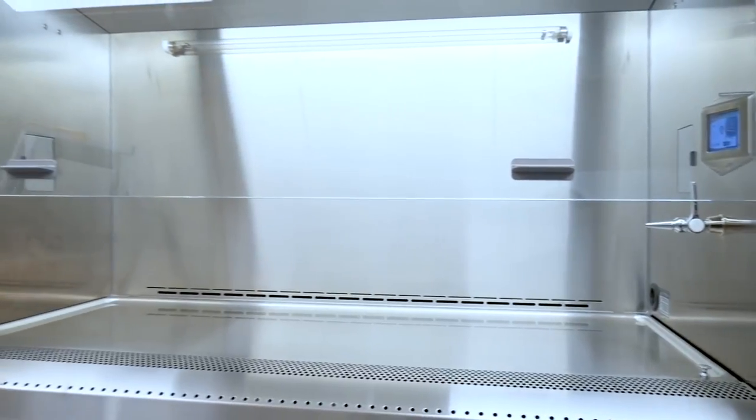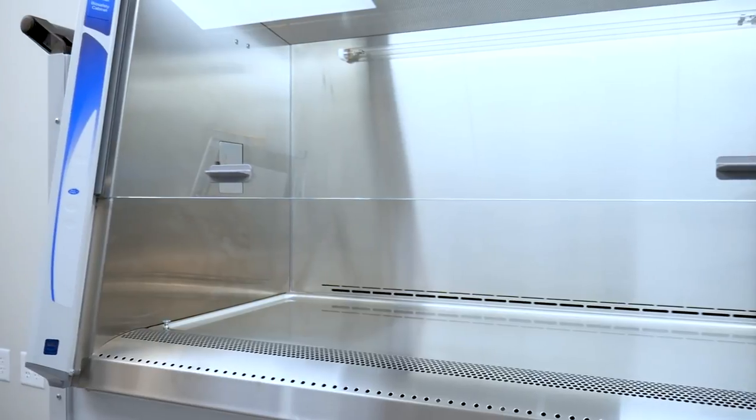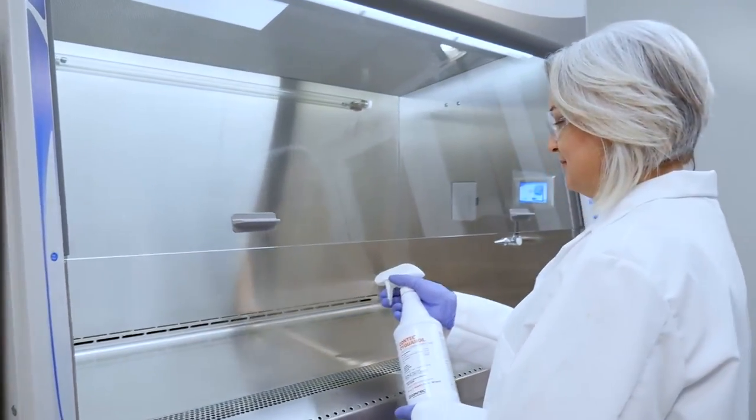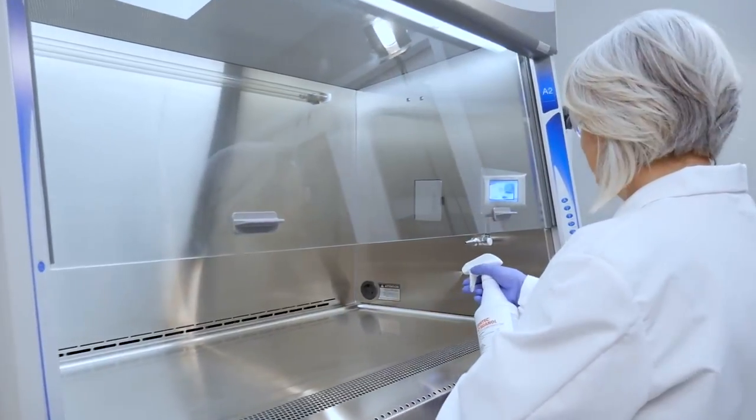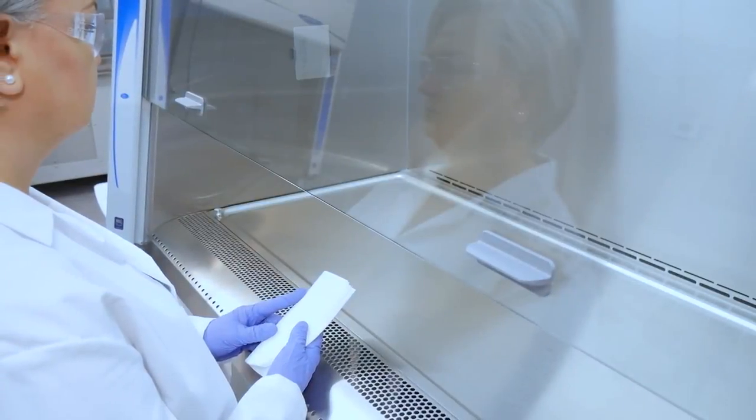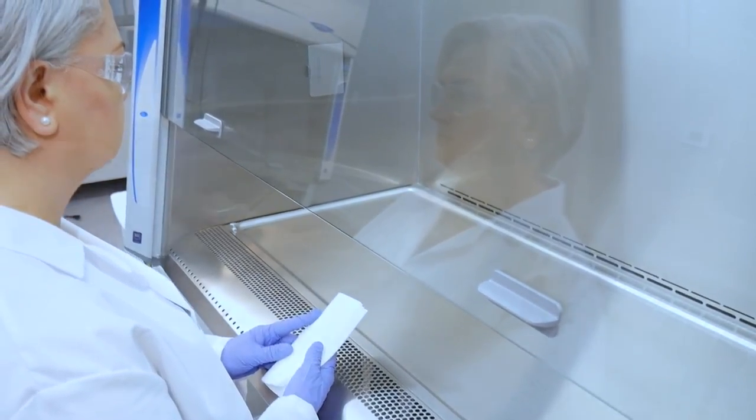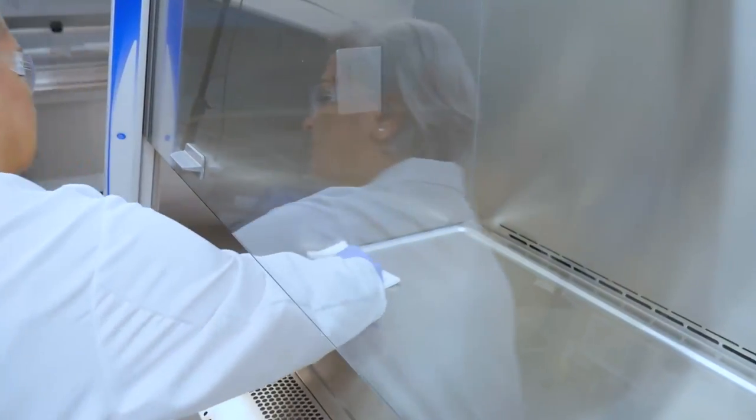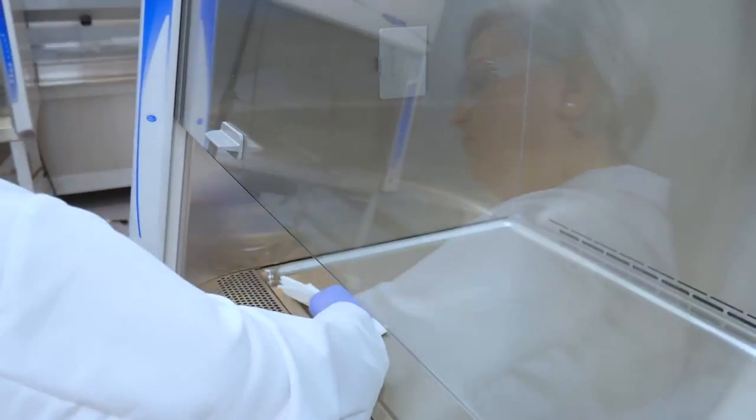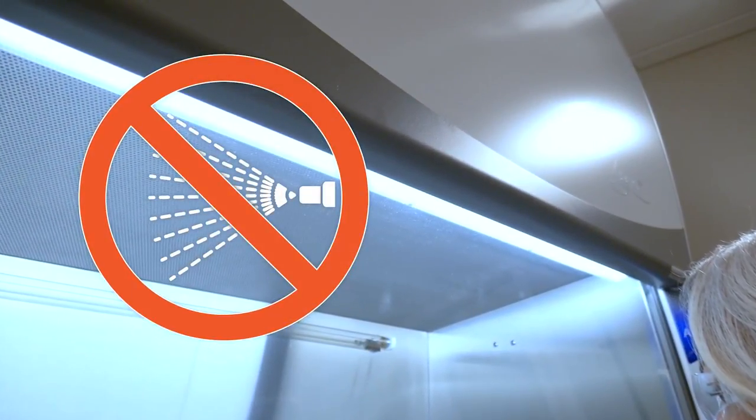Continue by disinfecting the interior of the BSC. 70% IPA is commonly used. However, select a disinfectant capable of decontaminating the materials you're using within your BSC. When applying disinfectant to the BSC, be sure to allow for the manufacturer's recommended contact time before wiping. As you wipe down the cabinet, work from the top to the bottom. Be careful not to spray the supply HEPA filter as damage may occur requiring replacement.